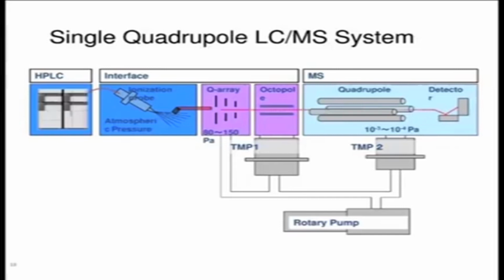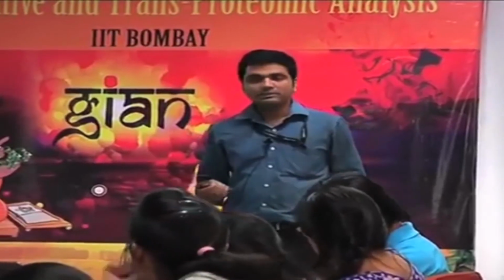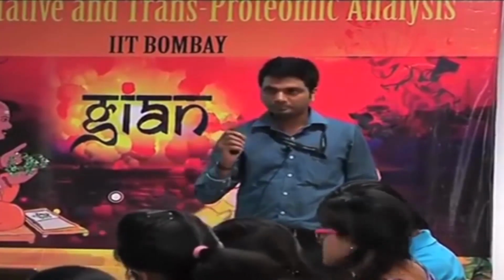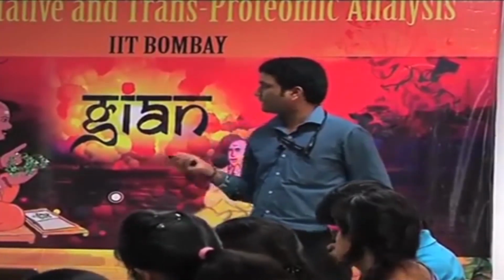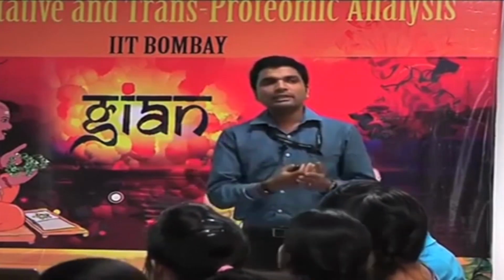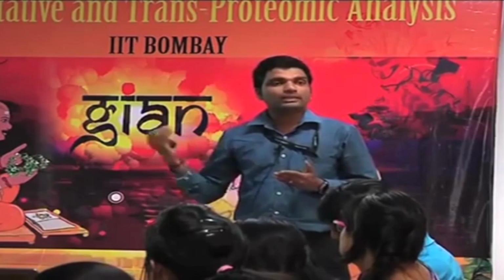For example, if you want to analyze particular ions, of a particular mass-to-charge ratio, the instrument is tuned in such a way that, based on the molecular weight, the DC to RF voltage is already tuned, because for this LCMS or any LCMS, before doing the analysis you have to do the calibration of the LCMS.